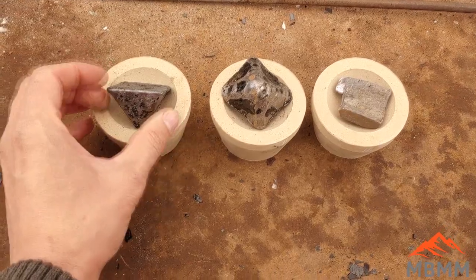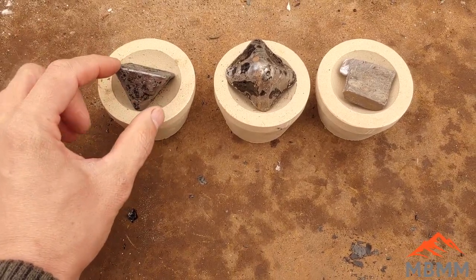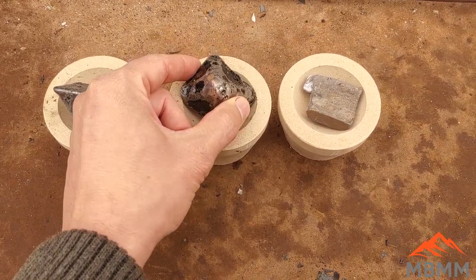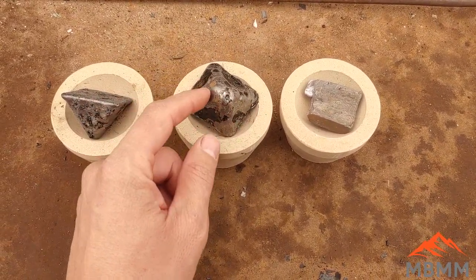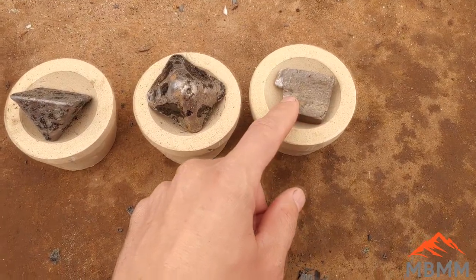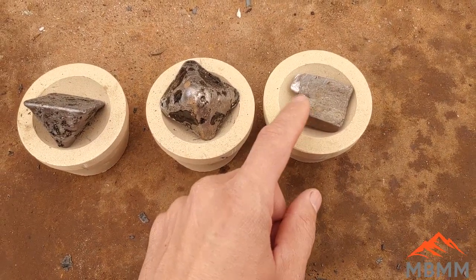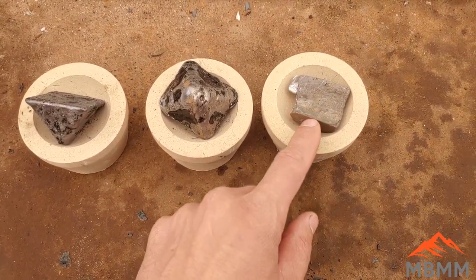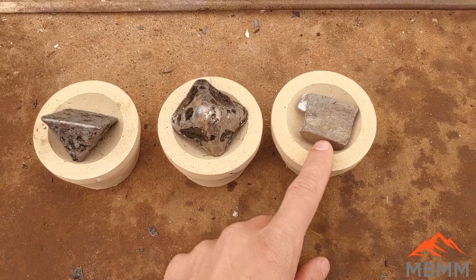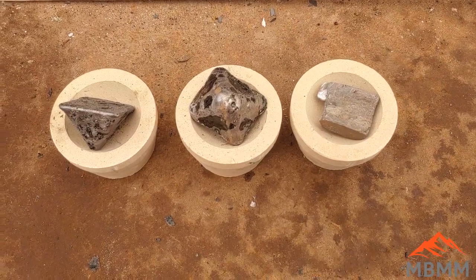Here are the three cupels we're going to use to oxidize our lead. The first is the material we didn't pan — that should have all the gold from that one-kilogram sample. The second is the panning tailings, re-smelted to get all the gold in. The third is a sample of the lead I use, just as a blank check to see if there are any precious metals in the lead itself. If there are — most likely silver — we'll subtract that from our final weights.